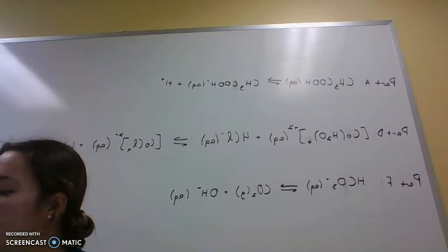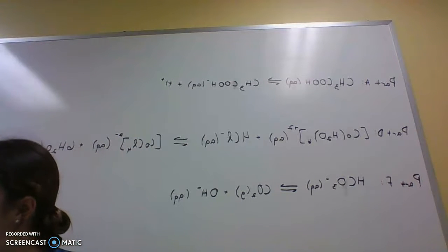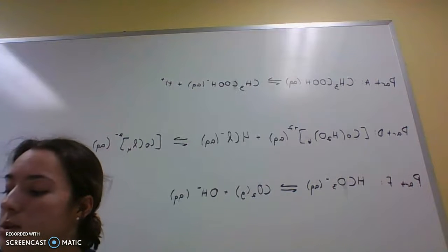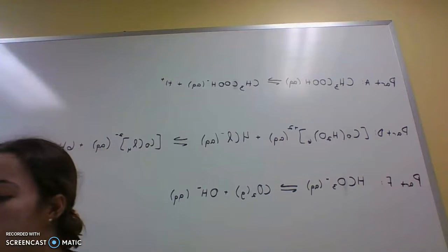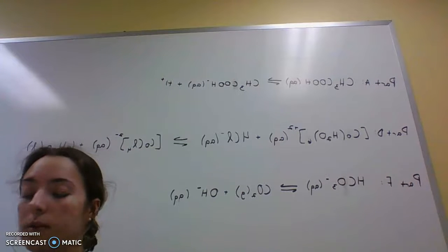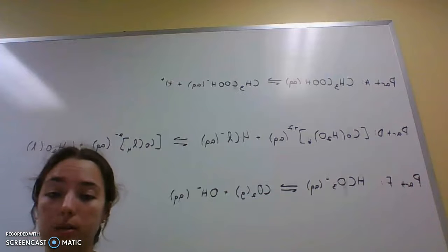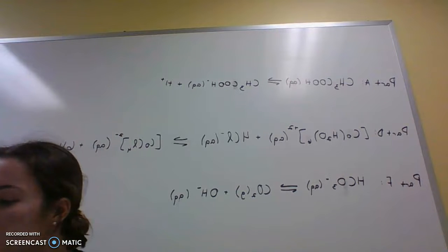Explain the significance of the first pH measurement. So the significance of the first pH measured, that was around 4.5, was to provide a base to compare our findings to after the reaction had occurred. So if we knew the original pH was 4.5, we could compare it to our findings after the reaction happened to see if it shifted left or right towards the products or reactants. And this could help us determine the stress, the shift, and why this happened. So that's why it is significant to know that first pH.